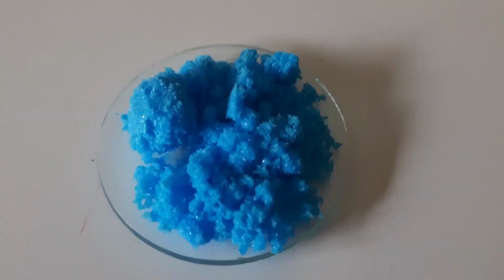colorless. Right, now it is very clear that most D block metal cations give colors in aqueous solutions, but some D block metal cations do not show colors in aqueous solutions. Now we are going to see the different colors of these metal cations in aqueous solutions and the reasons for these colors.